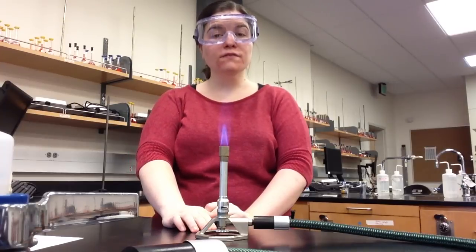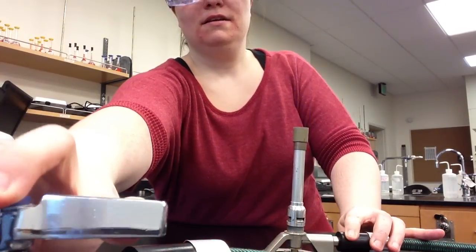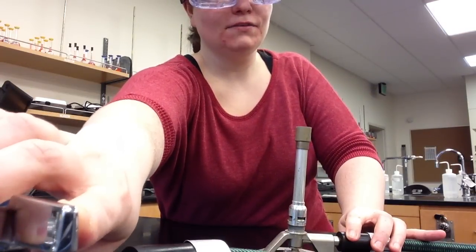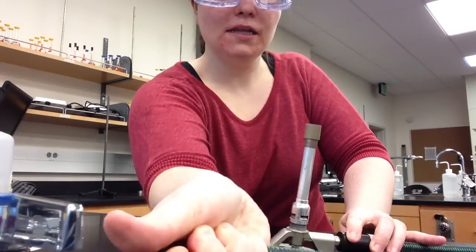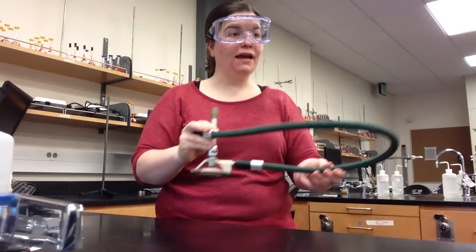Whenever I want to turn the Bunsen burner off, all I have to do is push the handle of the valve perpendicular to the valve in the closed position. I can then unplug the hose and put the Bunsen burner back in the cabinet where I found it at the end of the lab bench.